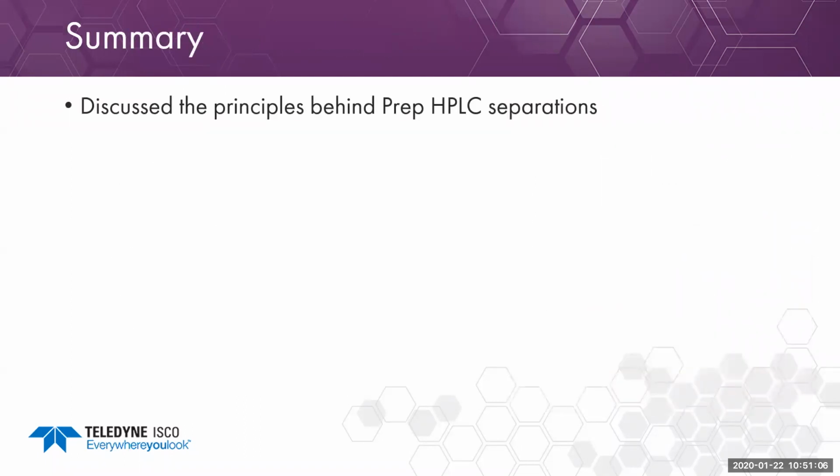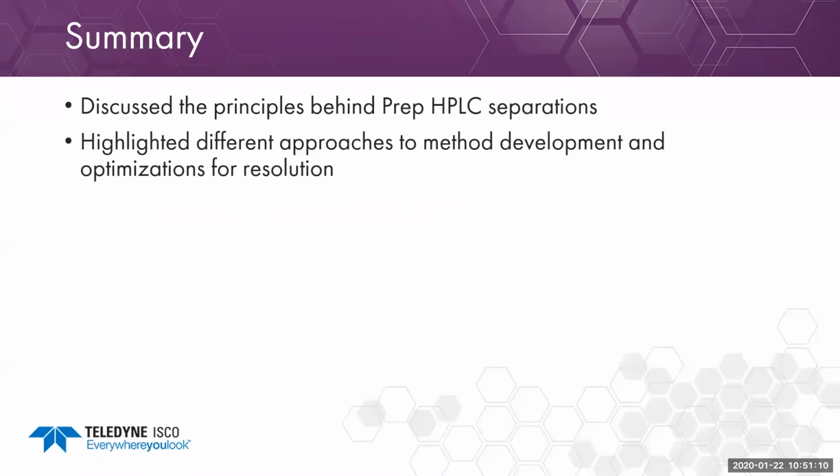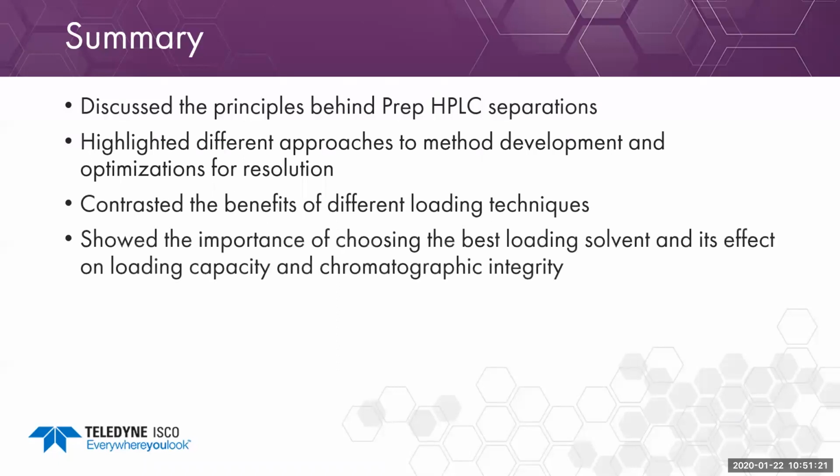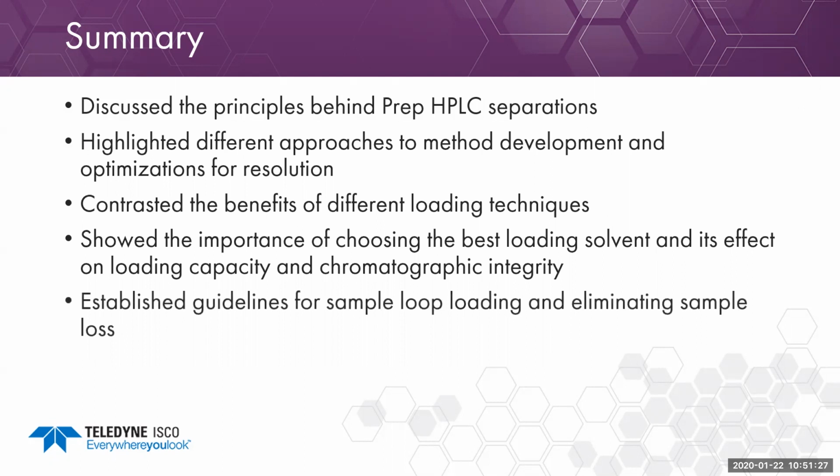operator variation. So in summary today, we discussed different principles between Prep HPLC separations. We highlighted some different approaches to method development and optimizations for resolution. We contrasted the benefits of different loading techniques. We showed the importance of choosing the best loading solvent and its effect on loading capacity and chromatographic integrity. And then we established some guidelines for sample loop loading and eliminating sample loss.